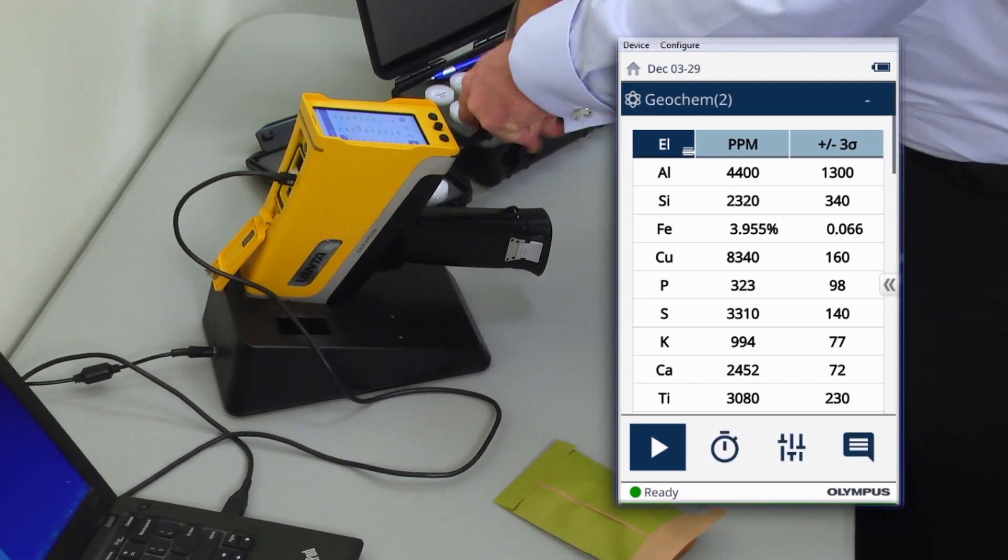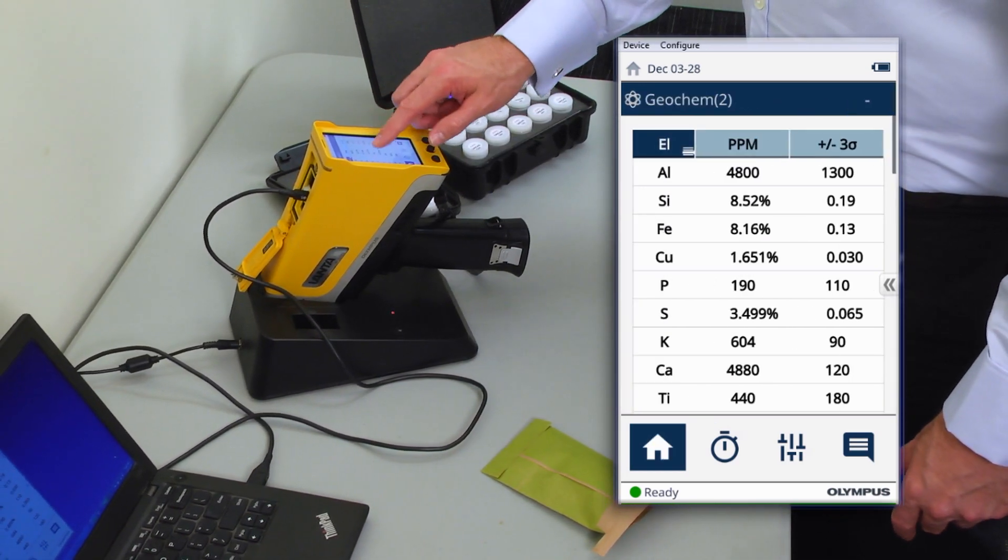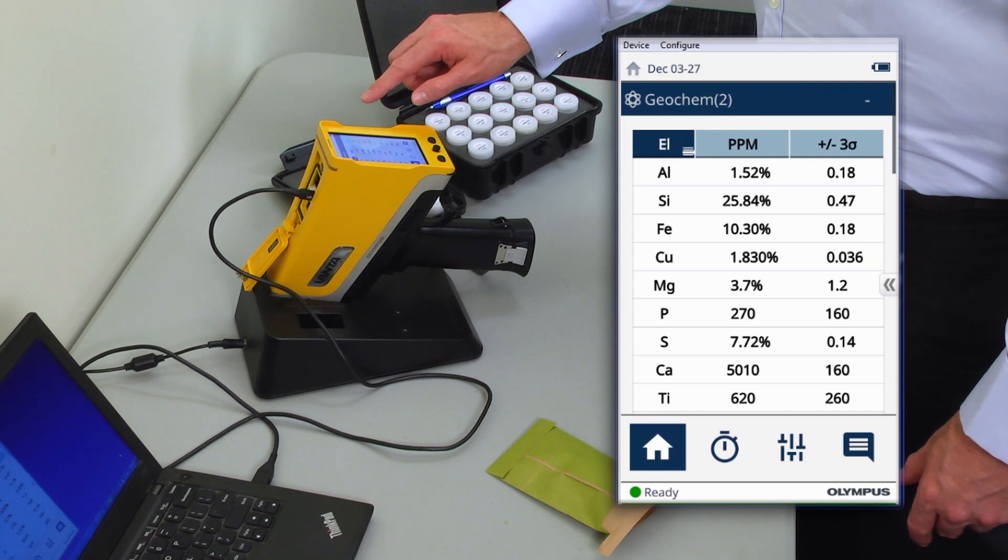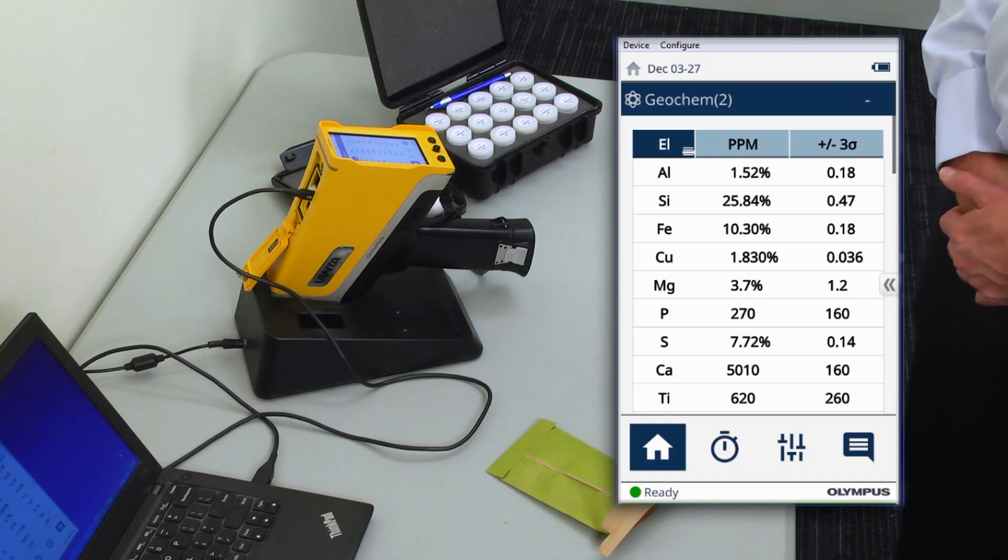So here's our paper, here's in the plastic bag, and here's straight under the sample cup. Now should we have a look at that in an Excel spreadsheet, Todd? Let's do it.